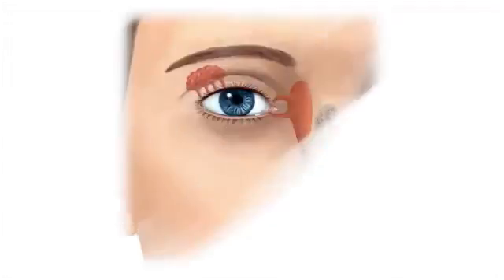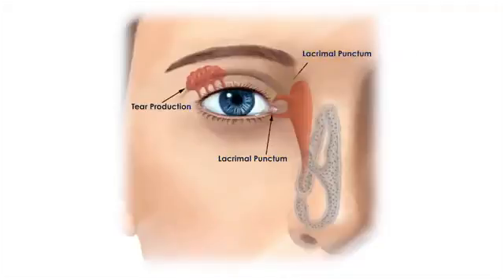The eye's lacrimal system is nature's way of maintaining sufficient moisture around the eye. Any excess fluids are drained via the lacrimal puncta into the nasal cavity. Traditional eyewash designs can actually sweep contaminants toward the inner corners of the eyes where the lacrimal puncta or ocular surface drains are located. If, for example, a chemical is introduced into the eye, we want to avoid forcing the contaminant into the nasal cavity, where it can be breathed into the lungs or swallowed.